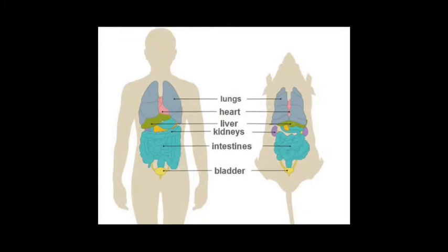Humans are also called Homo sapiens. Their evolved body shapes help them survive in hot and cold climates. Some things that define them are their advanced ability to think, languages, religion, etc. Now in this video, we will discuss the anatomy of a dissected rat, including body systems like the integumentary system, the respiratory system, the circulatory system, the digestive system, the urogenital system, and some additional observations, all of which will be compared to the anatomy of humans.